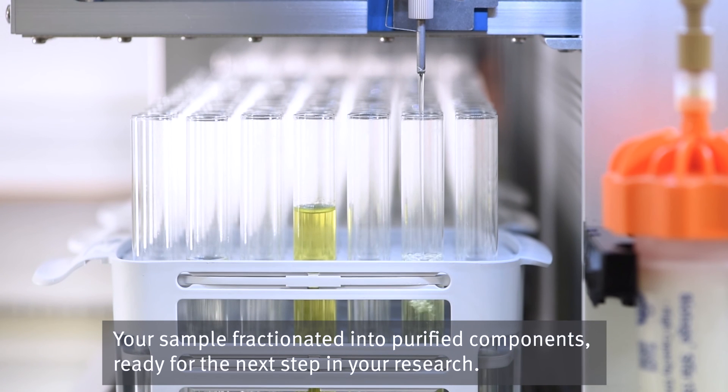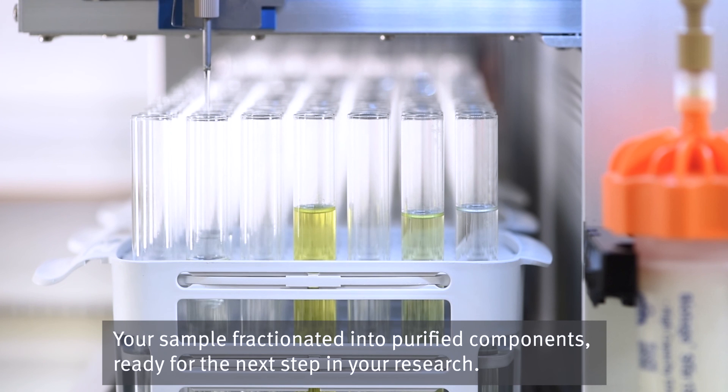The result: your sample fractionated into purified components, ready for the next step in your research.